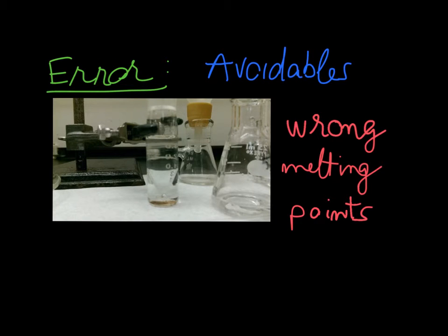One mistake that I made in this experiment was when I did the extraction of the acidic component. When I was drawing off the ether layer, by accident I took out some of the water layer that contained base. So when I measured the melting point for my acid, it was way off.